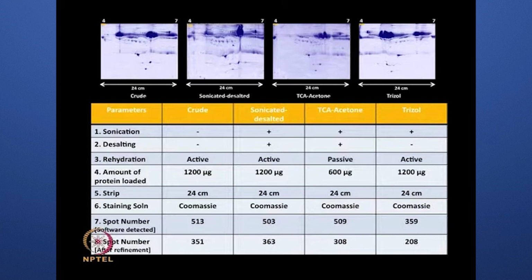So, I am trying to give you all the details of what one needs to actually perform before reaching the stage where you can compare the healthy control with the clinical samples. And this lecture is actually trying to cover various concepts which we have talked about in sample processing and in different lectures of two-dimensional electrophoresis.